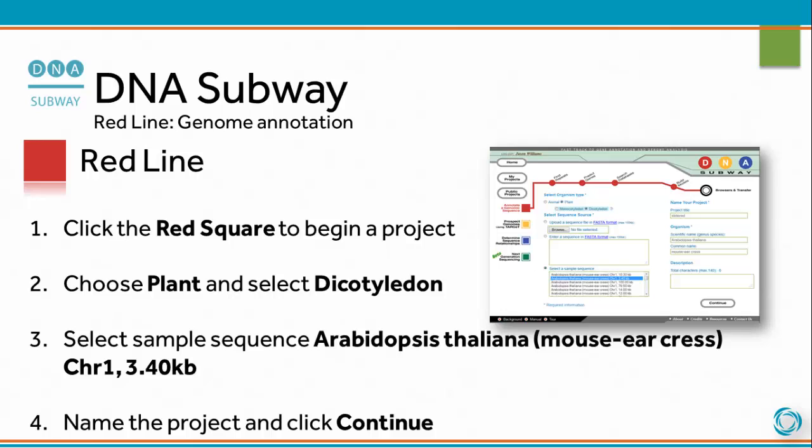Click the red square to begin a project. Choose Plant and select Dicotyledon. Select sample sequence Arabidopsis thaliana, mouse-ear cress, chromosome 1, 3.40 KB. Name the project and click Continue.